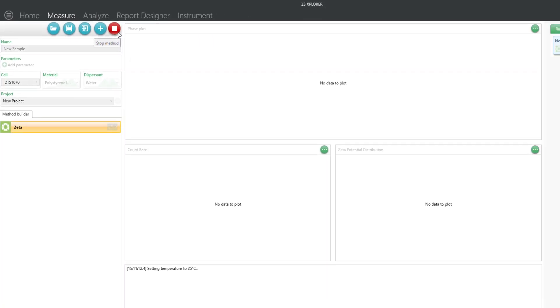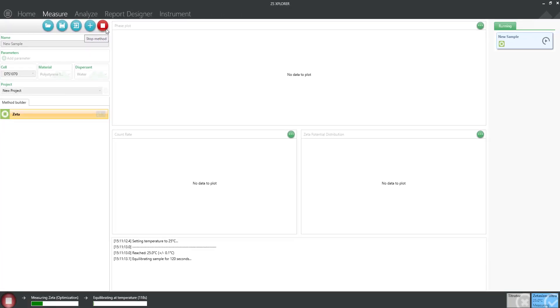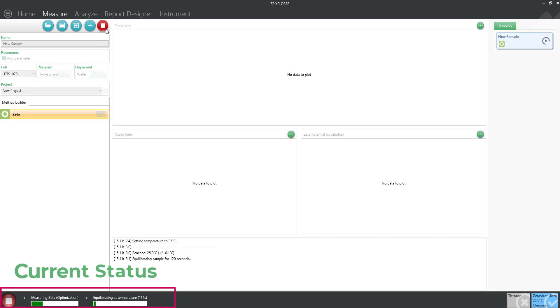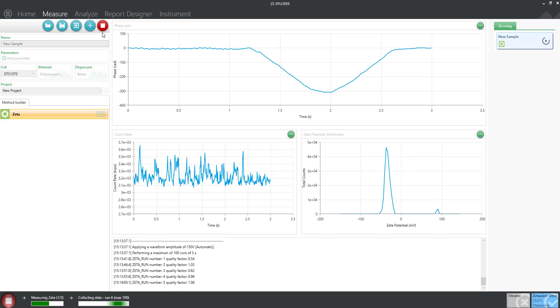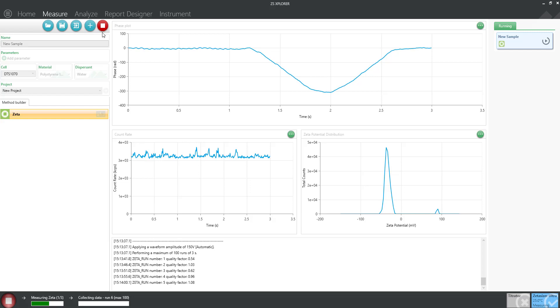The measurement will first start with your equilibration step, followed by the optimization of voltage and attenuator settings. The measurement will then begin, which is usually very fast even for triplicate measurements. You can view real-time data.